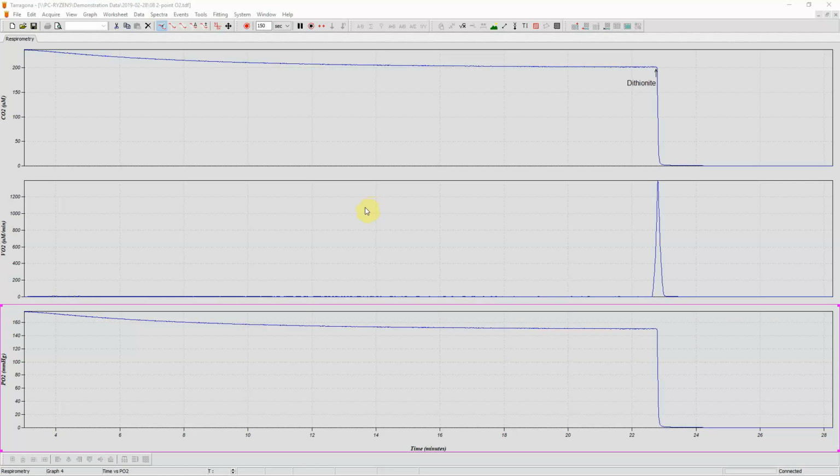Today I'm going to show you how to perform a two-point calibration of your NeoFox. A two-point calibration uses the oxygen tension of air and zero oxygen tension to correct your NeoFox's calibration. What I mean by correcting your calibration is that your NeoFox already has a calibration that converts the lifetime to oxygen tension, and the two-point calibration, or maybe just a single point, is going to correct that calibration.